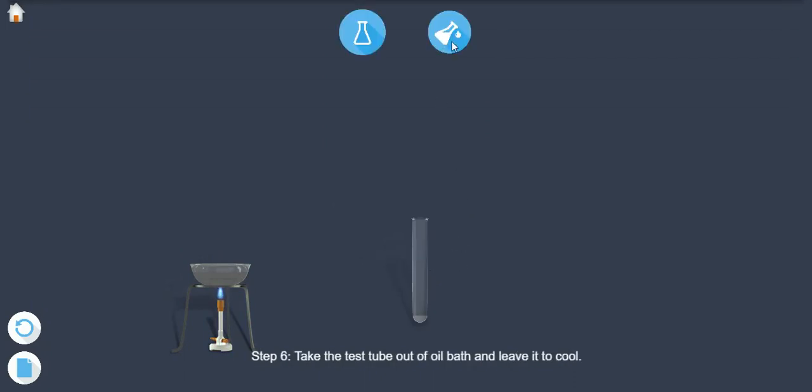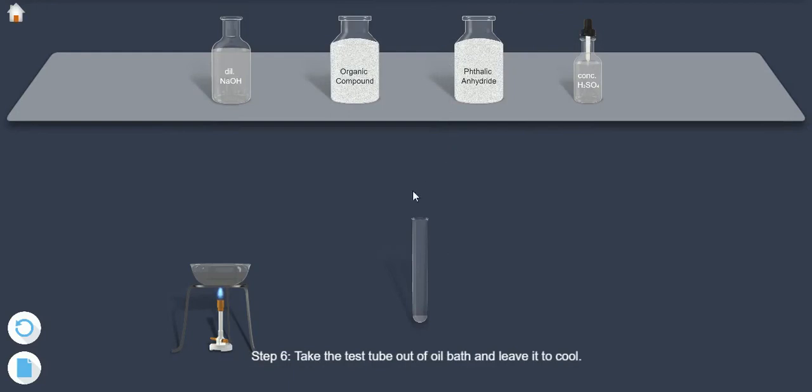Step 6: Take the test tube out of oil bath and leave it to cool.